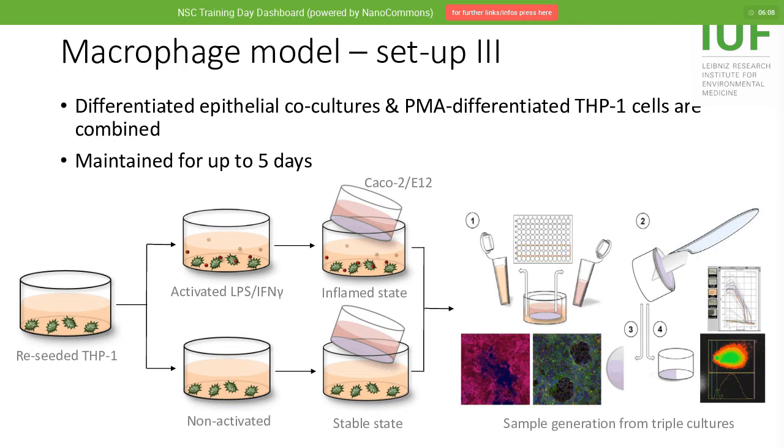Once you have the triple culture set up, you can maintain it for an extended amount of time. We have tried everything from just 24 hours up to 6 days without exposures and 5 days with exposures. This transwell setup, and especially the 12-well format, offers you the great opportunity to have a vast amount of different samples that you can probe.